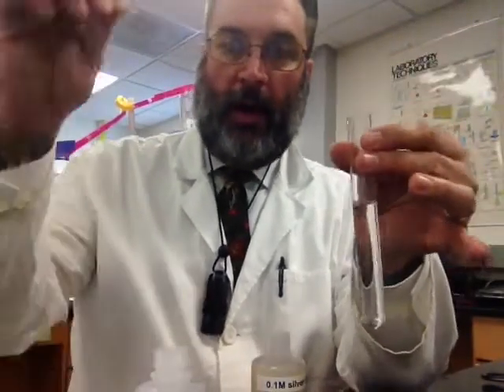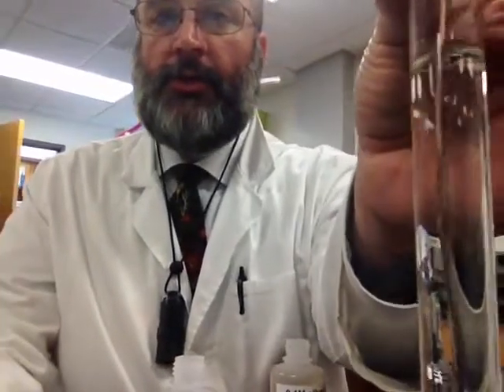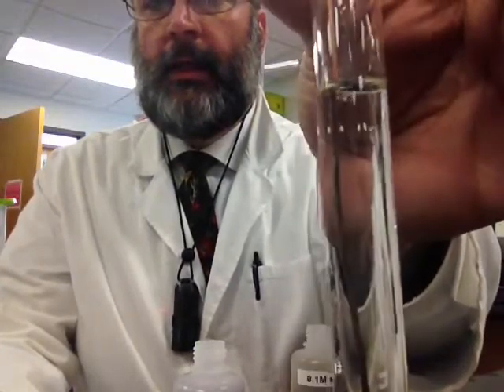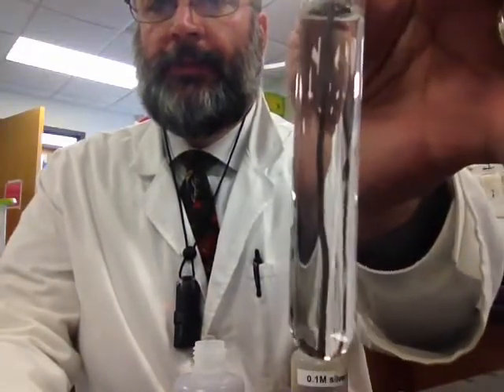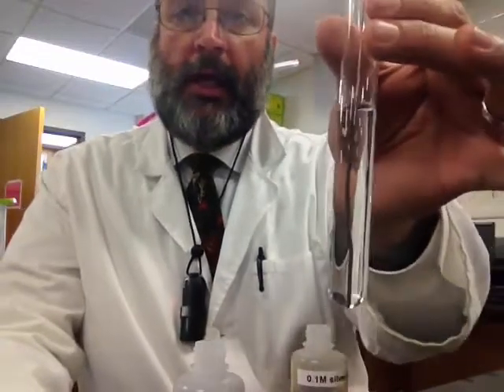I'm going to put the copper wire into the silver nitrate. And I want you to see if you can notice any changes right away. Okay, did you see the change happen right away? Look at that. It doesn't look like the copper wire on top anymore, does it? Okay? It's got a very different look to it. Now this reaction takes a little bit of time. I'm going to show you what it looks like if you leave it for a little while.